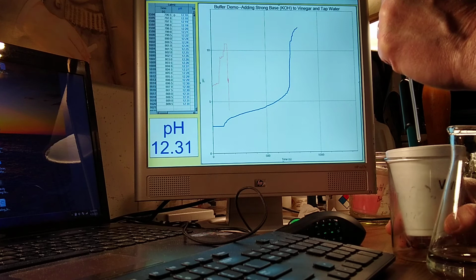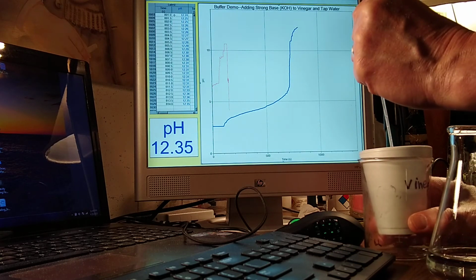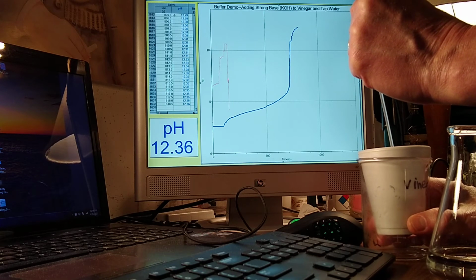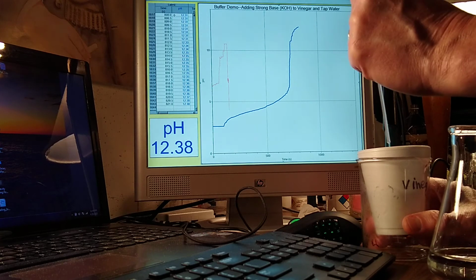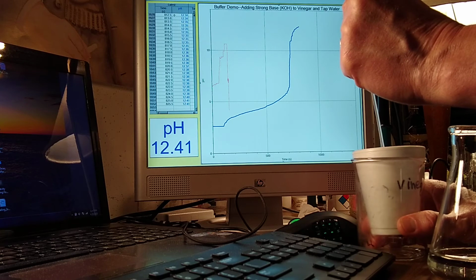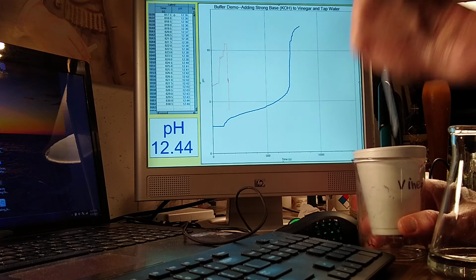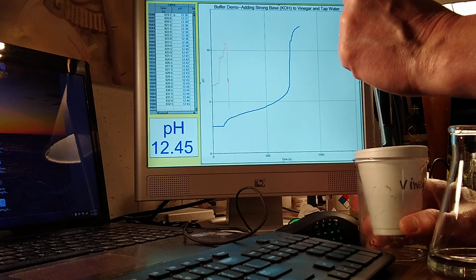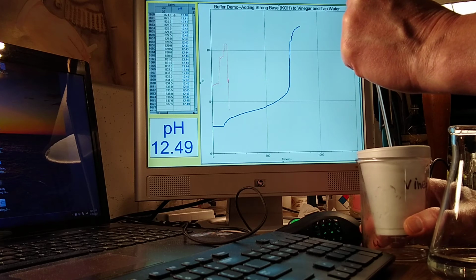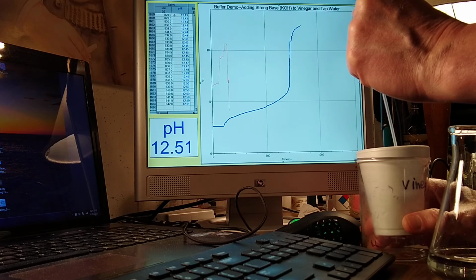So again, when you're watching these videos, I realize you don't want to sit here and watch me stir a beaker for 20 minutes. You're going to have to fast forward and rewind and pick up everything. But you should be picking up the fact that what I just generated is a titration curve of the addition of a strong base to a weak acid. I could use this curve to identify this unknown acid. If I wasn't told it was acetic acid, I could figure it out.